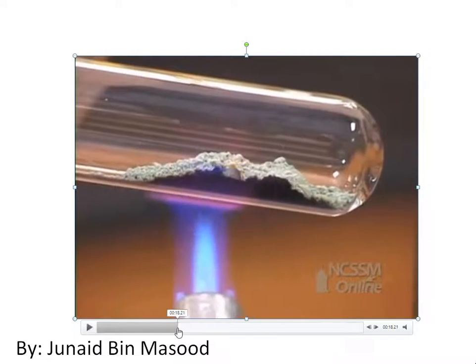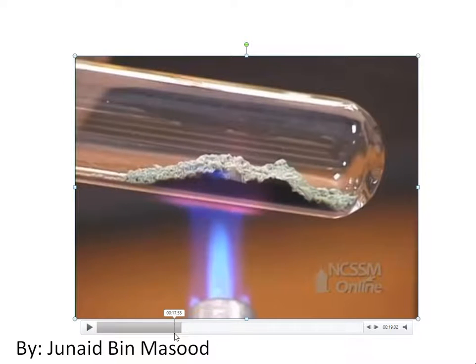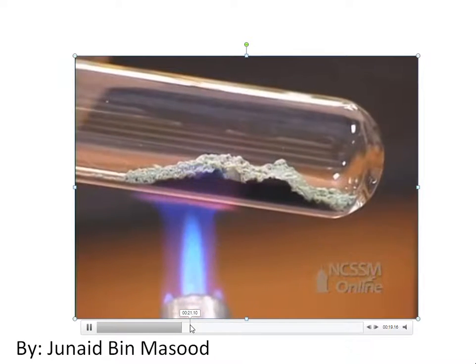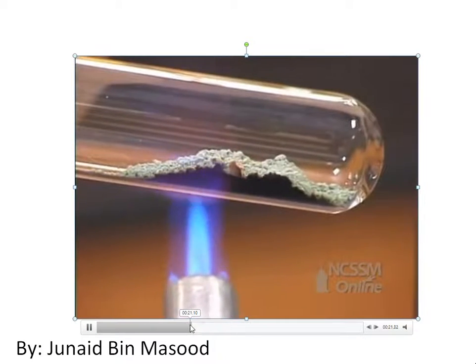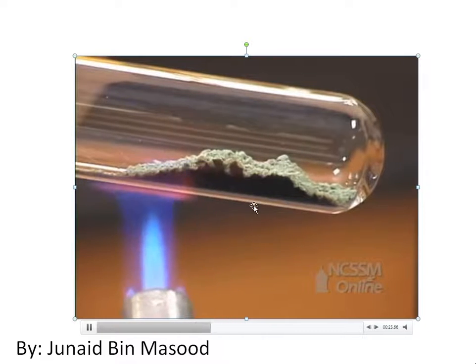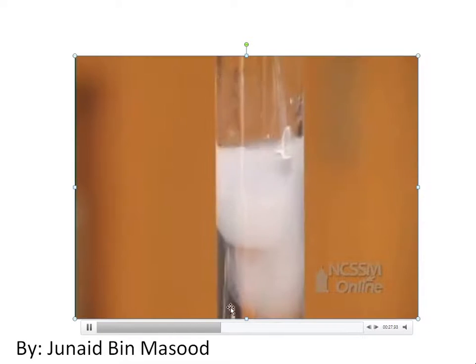CuCO3 is the chemical formula, and this means that it has one atom of copper, one atom of carbon, and 3 atoms of oxygen. And it is a compound, because a compound has atoms of different kinds. Now we are heating it, and on heating, it should release carbon dioxide and copper oxide. Now this is being heated.